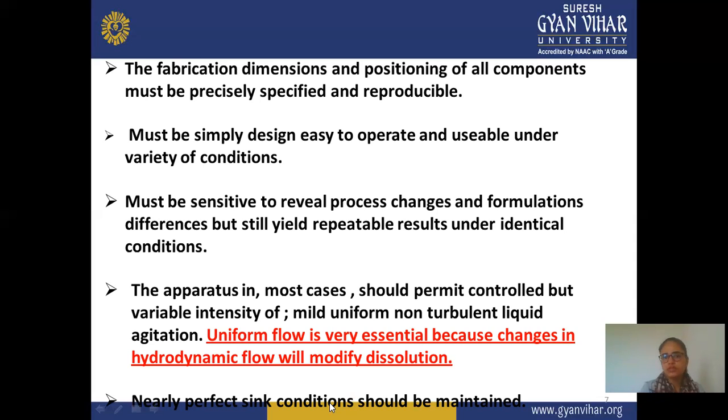You can say it gives a good result, and when you change the conditions, it can easily evaluate the result or process change of different formulations, but still give repetitive results under identical conditions. This means when you handle this apparatus, it should give proper or identical results under repeated conditions and not show any type of error.